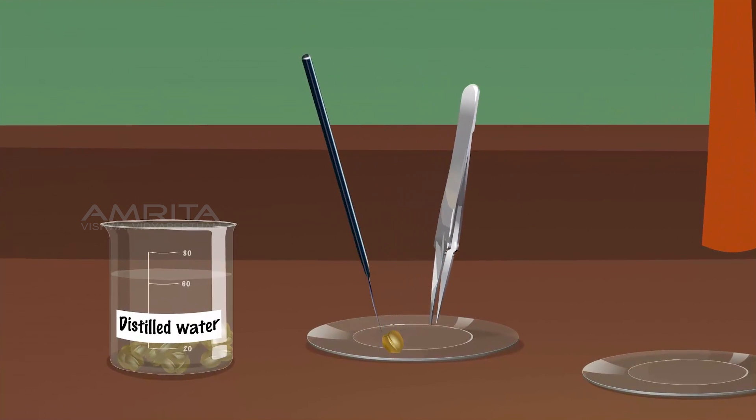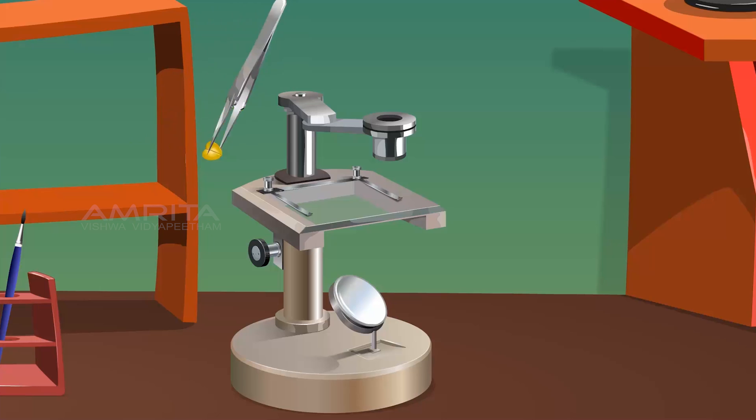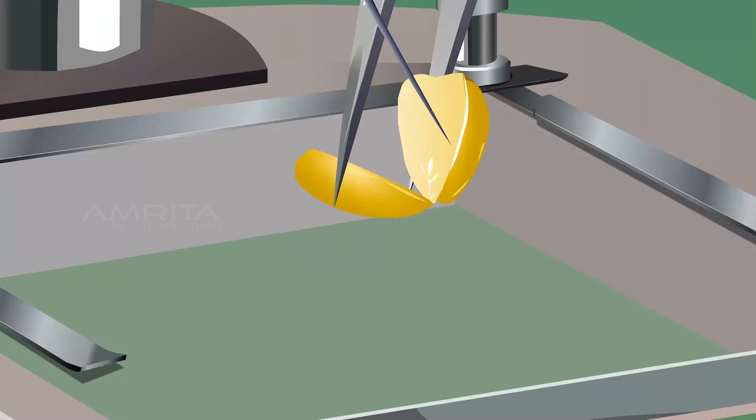Remove the seed coat of the gram seed using the forceps and needle. Using the forceps, pick up the seed and place it on the stage of the dissecting microscope. Separate the two cotyledons of the gram seed using the forceps and needle. Observe the seed through the lens of the dissection microscope.